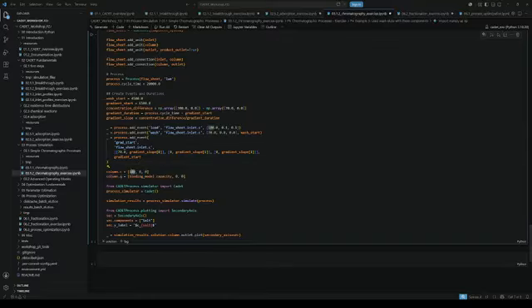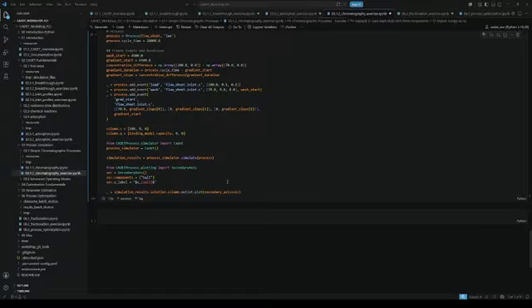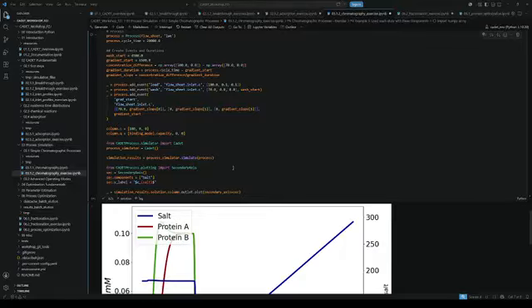So at the beginning, the liquid phase is completely filled up with 180 millimolar concentration of our salt, and the column or the stationary phase is also completely saturated with our salt. All right, let's run this experiment and see how this system looks.